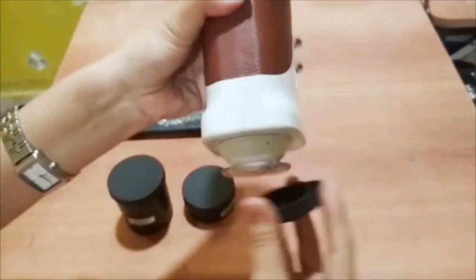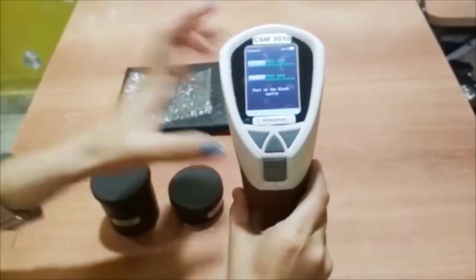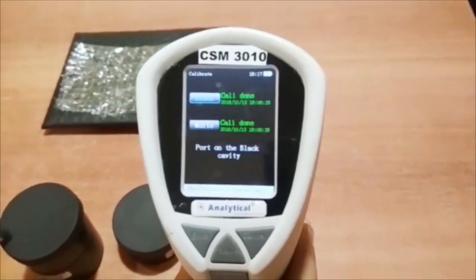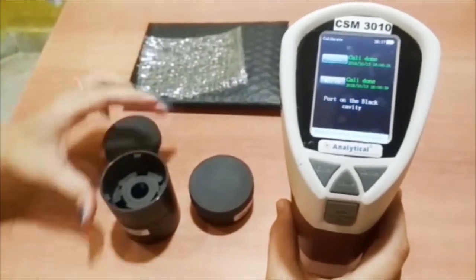First, remove the black cover from the bottom of the instrument. For first use, calibration has to be done. Calibrate the instrument on the black and white calibration board.